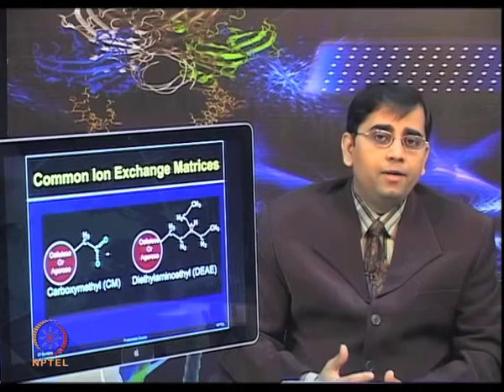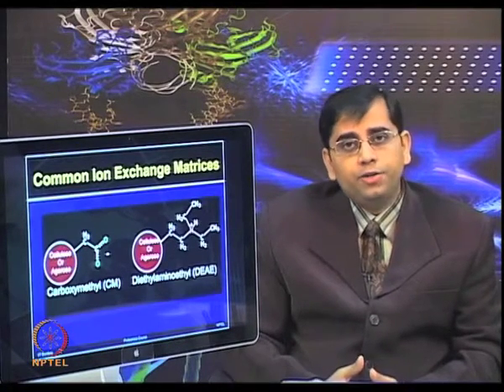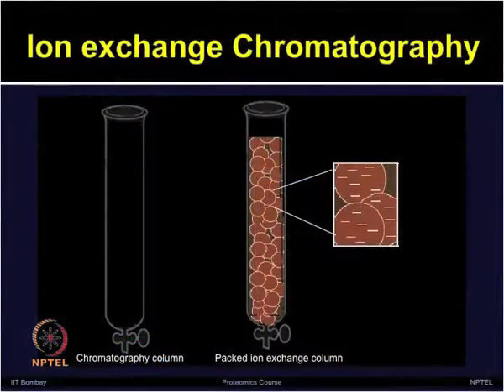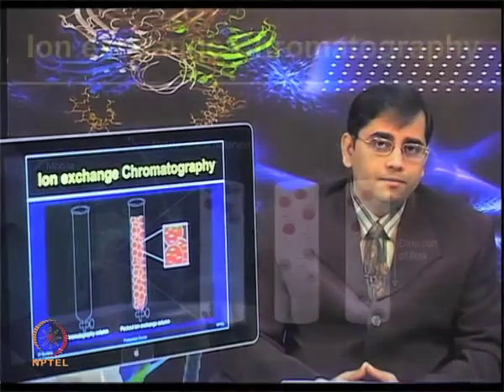When a desired protein is negatively charged, the anion exchange chromatography method should be used. In ion exchange chromatography, the column is packed with a resin, whether it is a cation or anion exchanger, depending upon the charge of the protein that needs to be bound to the column and purified.